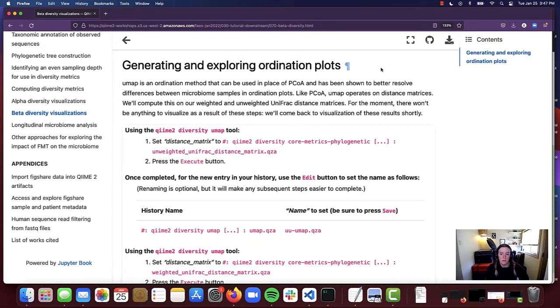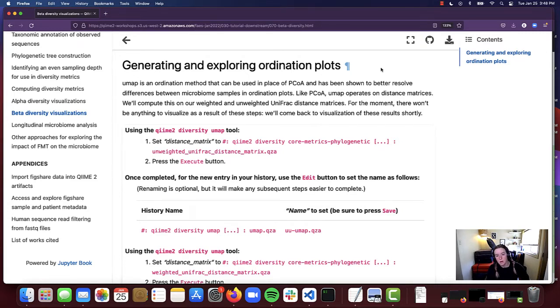Similar to PCoA, UMAP operates on distance matrices and we'll compute this on our weighted and unweighted UniFrac distance matrices — those distance matrices calculated based on those two different diversity metrics. For the moment there won't be anything to visualize as a result of these steps, but we will come back to visualization of these results.